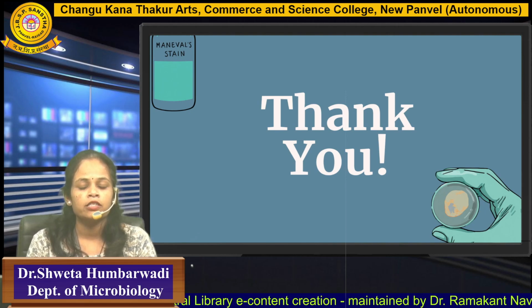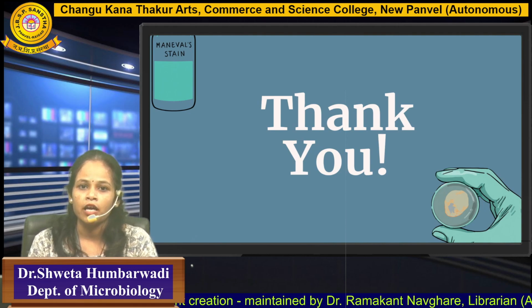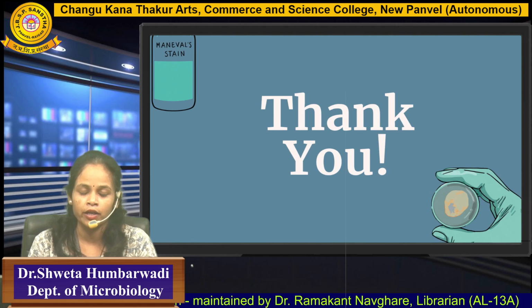So after performing the capsule staining, we will get an idea about the nature of the organism, which is very helpful in the identification of the organism also.